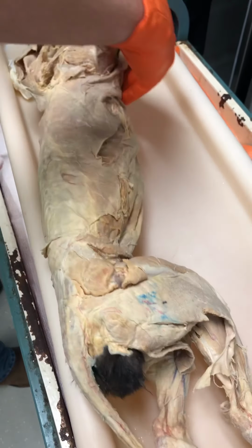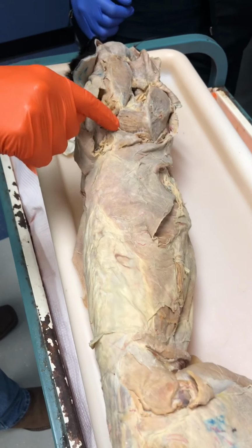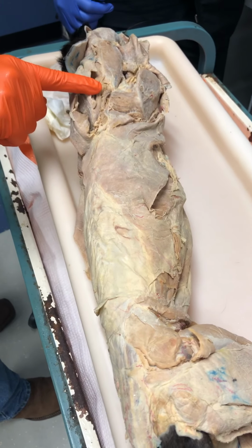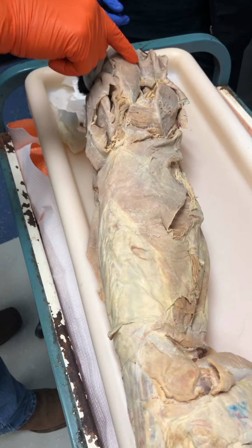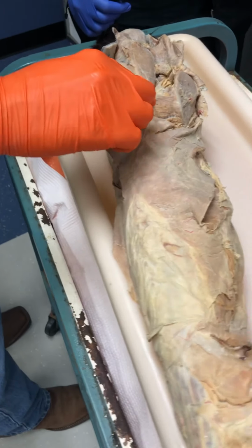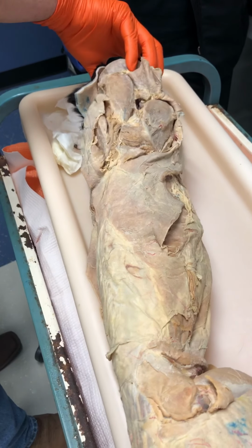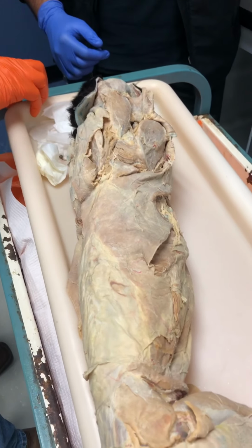Then if you take those two forelimbs and put them together, you can see these muscles running from the spinous processes of the vertebra out to the scapula on both sides. Those are the rhomboids. And then you can also see them just deep here going up towards the temporal bone. These are the splenius. So the rhomboids will retract the shoulder blades like that, whereas the splenius will either rotate the neck or extend the neck if they both contract at the same time.